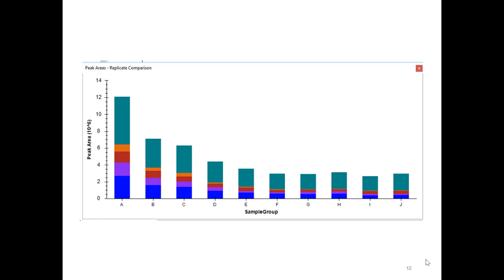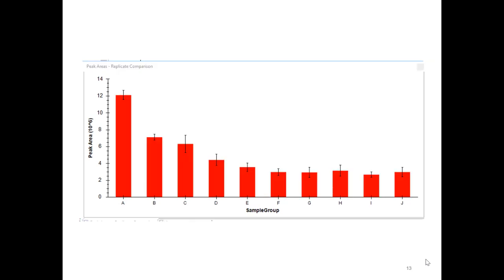When you're looking at the data, like I was just saying, if you had, for example, some calibration curve, you can do the sample grouping like I did with the annotations. So this is just some curve that I think is the opposite of the way Sue likes to label her curve. I had A be my highest point, all the way down to J being my blank. And in the peak areas, you can see that this has some kind of canonical calibration curve shape. I can group these by all transitions.